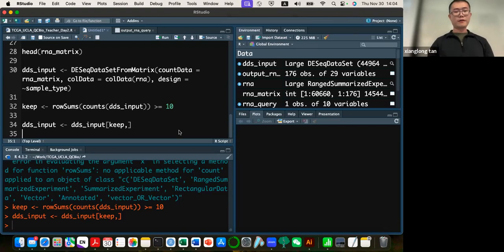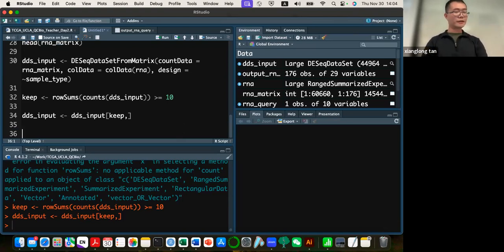So we can run the DESeq program by DDS equals DESeq of our input.